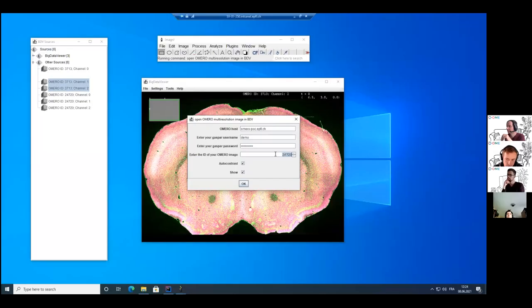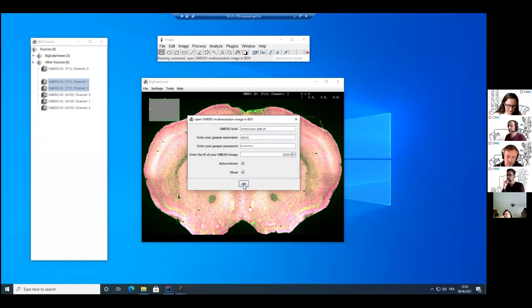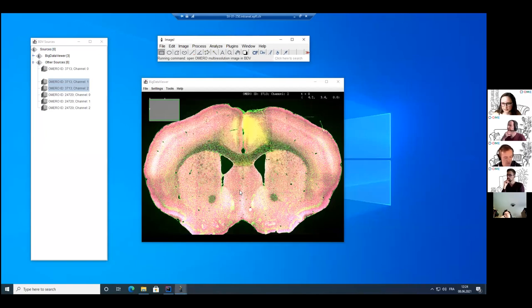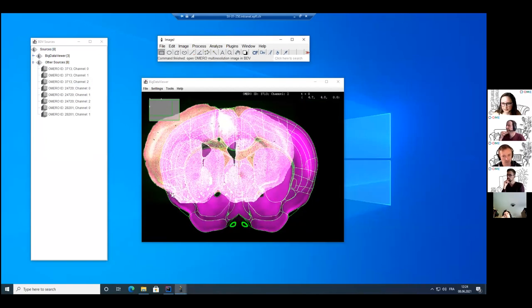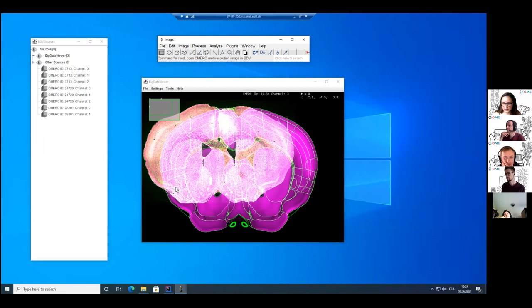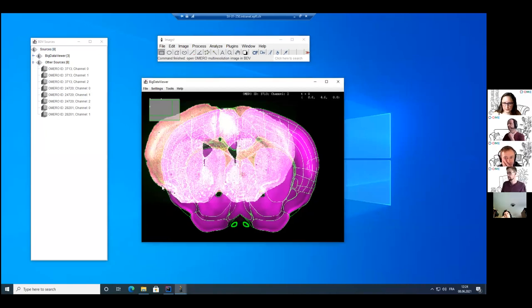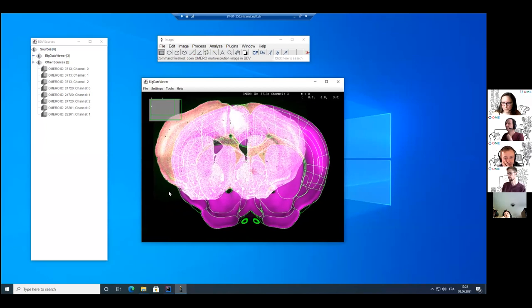ID is okay. Let's enter the ID. And you can see here that I have opened my slides from the Atlas and this is just overlapping the brain flow image that I want to map to the Atlas.